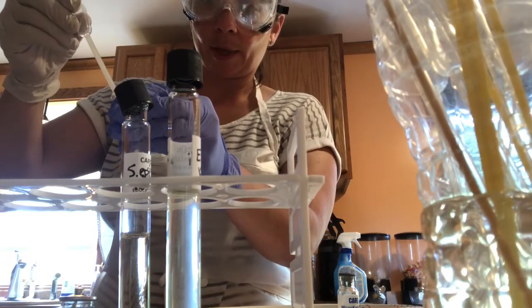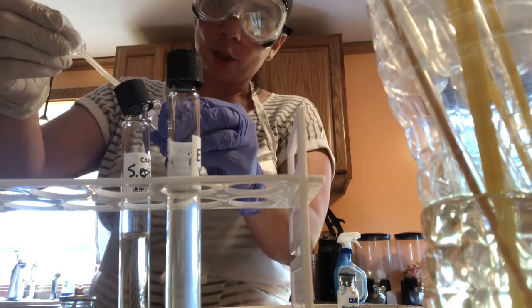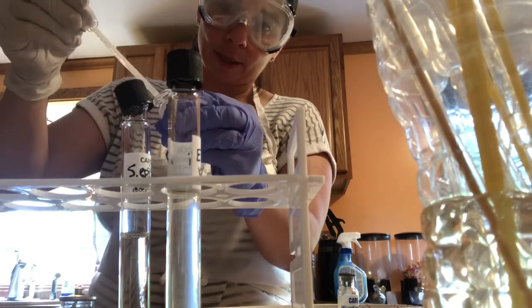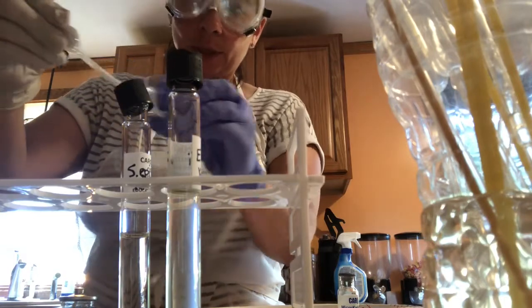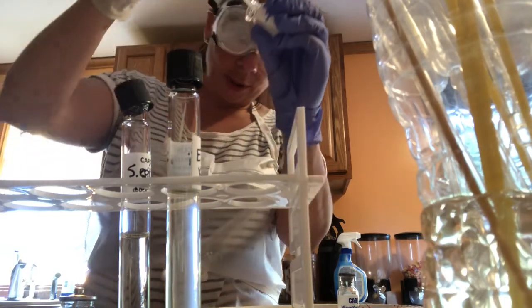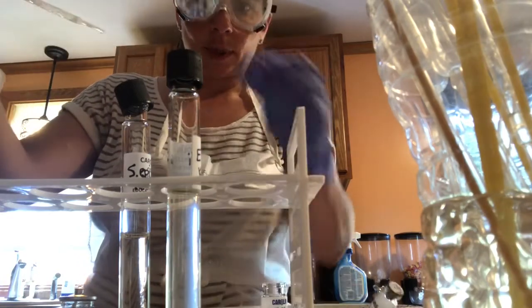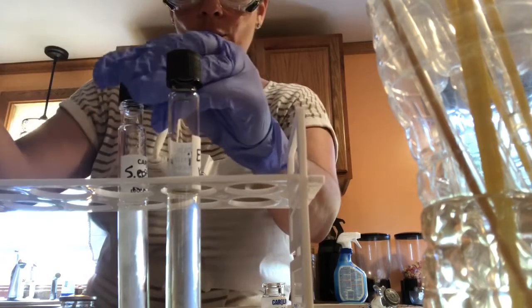Mix it by pipetting. And to not get air bubbles, you basically don't want to hear that, right? You don't want to suck it all the way up. Just about halfway up and then gently back down the side of the container. Up and down. Suck up all the contents in that glass vial. Okay, and then you're going to pipette it into the nutrient broth tube.